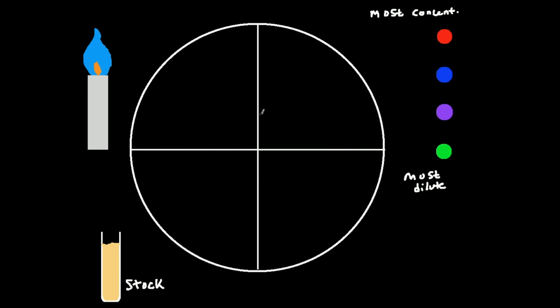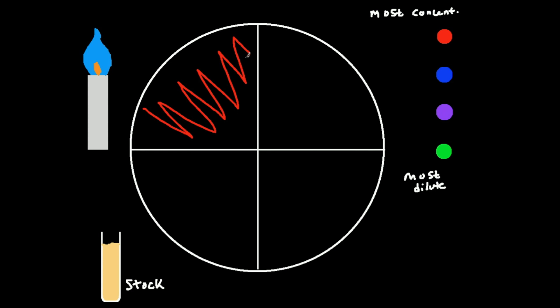The important thing to remember: you're only going to dip your inoculating loop in the stock one time. So the first thing I'm going to do is put my loop in the flame, sterilize it, make sure it's good and germ-free, take it out, and let it sit for about 10 seconds — that's the golden rule for letting it cool down enough. Then I'm going to dip it into the stock solution. That's the only time I'm going to dip it in. Then I'm going to streak in a zigzag fashion in one of these quadrants. That's the only time I ever dip my inoculating loop in the stock, so I no longer need the stock.